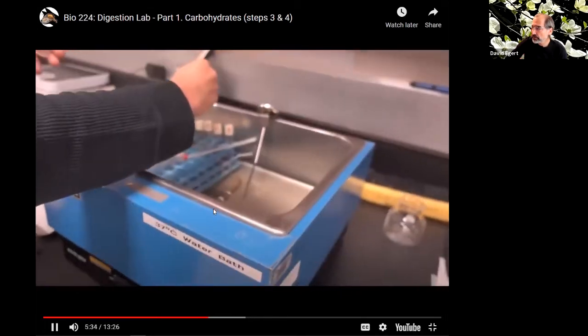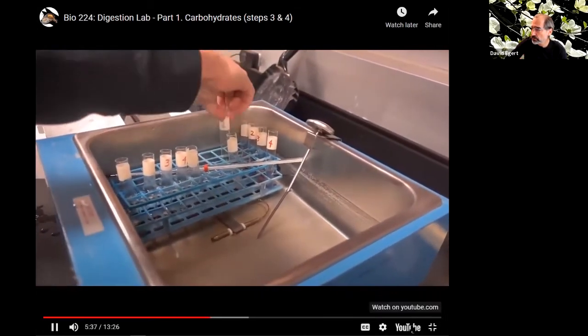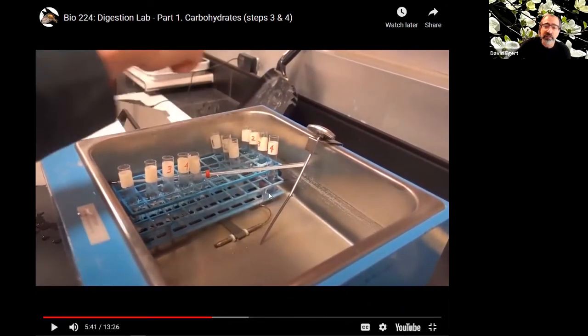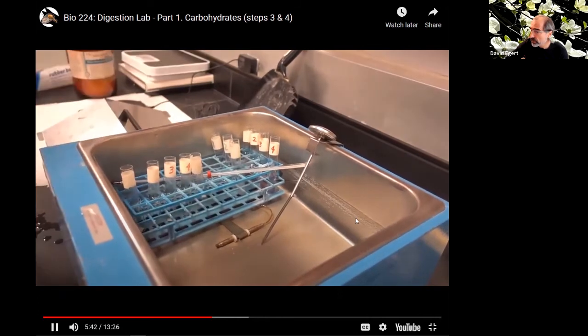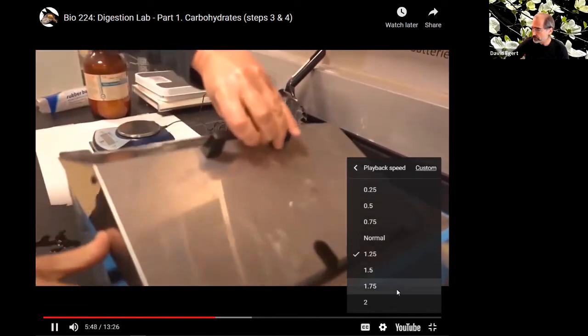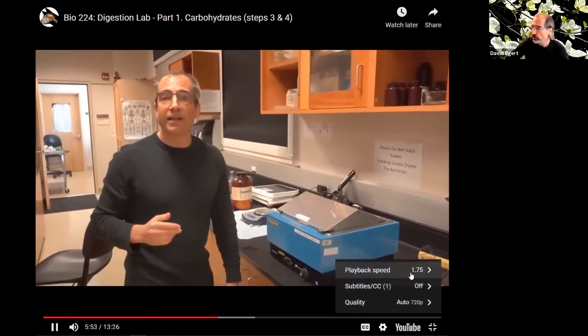Here we see test tubes 3, 2, and 1 going in. This is in vitro, in glass and outside of the body. We want to mimic what it would be if it was actually inside your mouth, which would be around 37 degrees. That's body temperature in Celsius. So we're putting them at the right temperature, as if it was in your body. Test tubes from parts 2 and 3. We're going to close this up and come back in half an hour or so and see what happens.